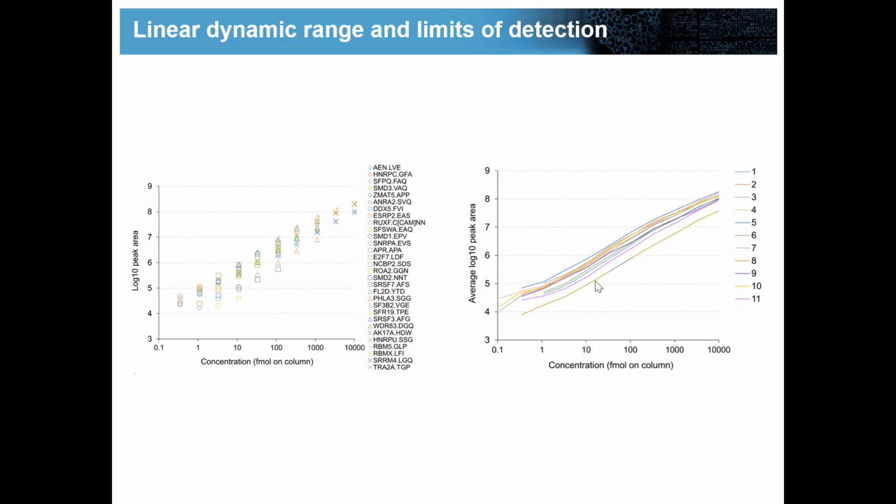Yes. I have a couple questions. Is there a public library available with spectral libraries? Oh, so that's what I'm going to talk about next in much more detail. The other one was, I mean, you can't apply iTRAQ to these, so how do you quantify it? And we're going to talk about it.